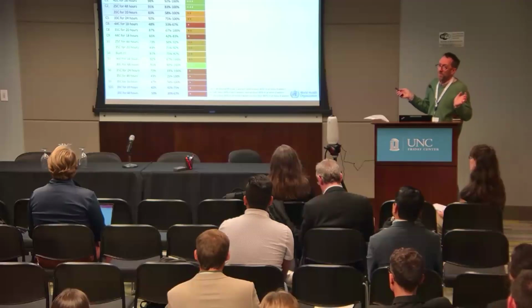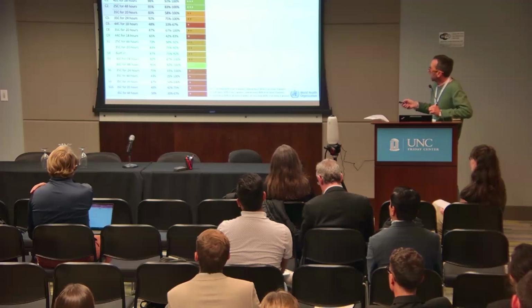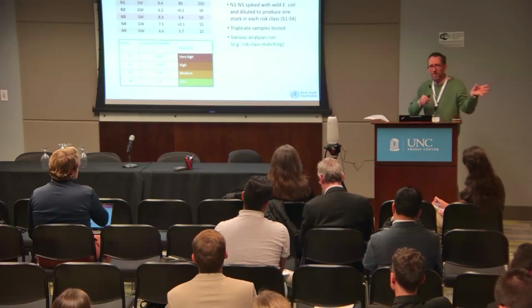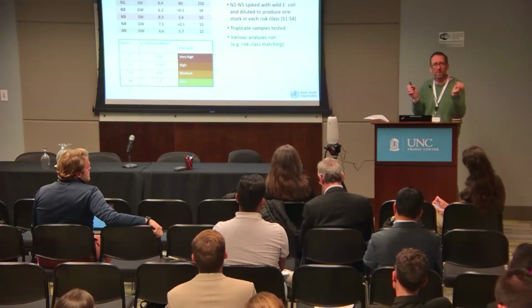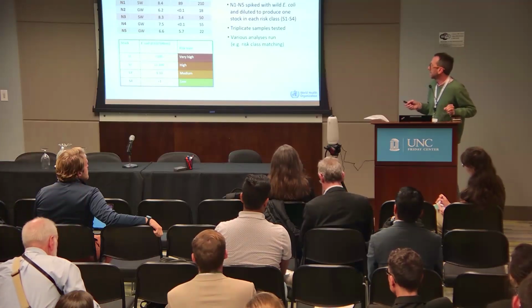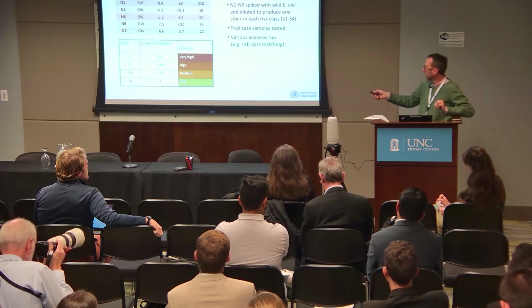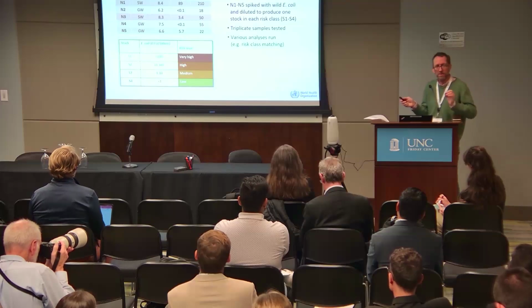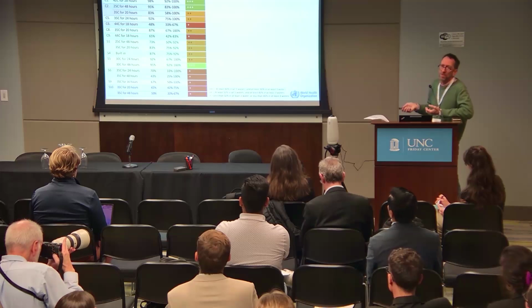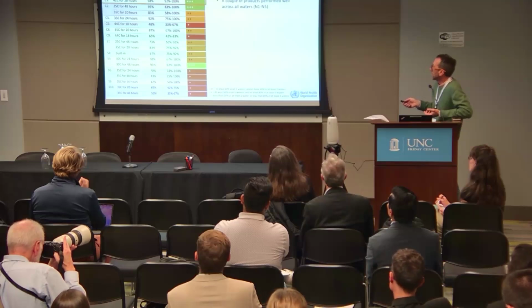A lot of results to share, but one thing I wanted to say about that risk matching is we would try to see if the reference method and the trial method would result in the same risk classification. So if a test kit said 12 and the reference method said 23, we'd say that's both in the high risk category, so that would count as a match. And then we could look at the proportion of replicates that matched for the different categories and the different waters.